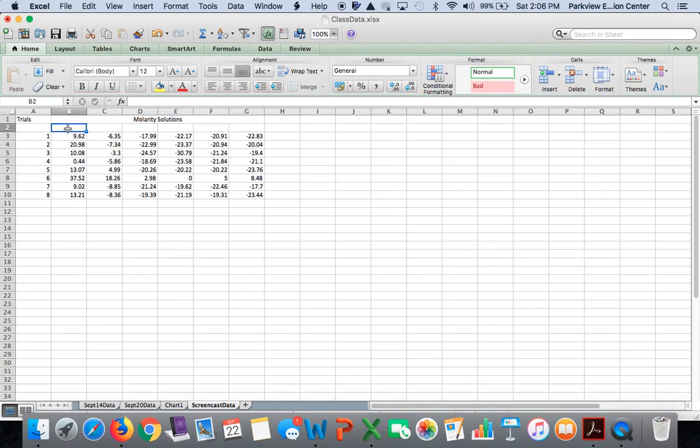We'll save these cells for our actual molarities. So that first one is 0.0 M, space, 0 M. I'm going to hit tab, and it'll just move me out of that cell into the next one. 0.2 M tab, 0.4 M tab, 0.6 M tab, 0.8 M tab, 1.0 M, enter or tab. I don't have a space there, so I just double clicked. I'm going to put a space in between the 0 and the M. Done. Enter.